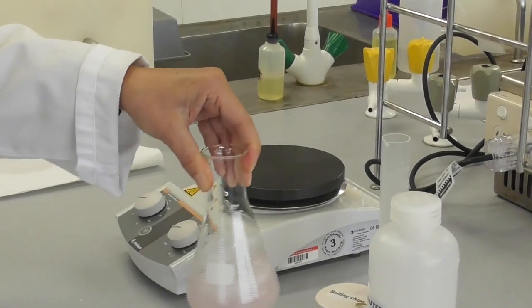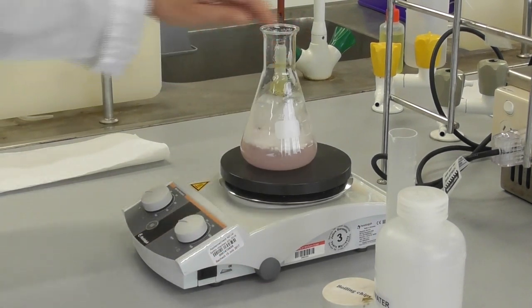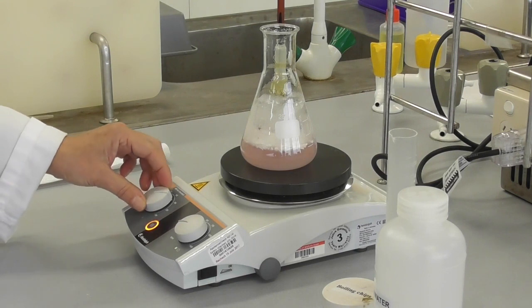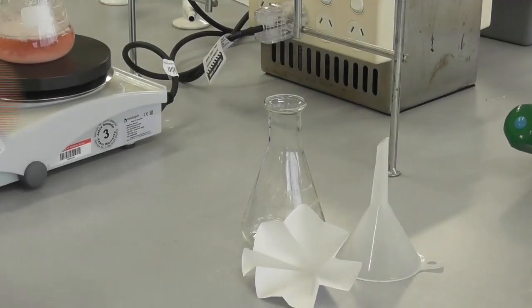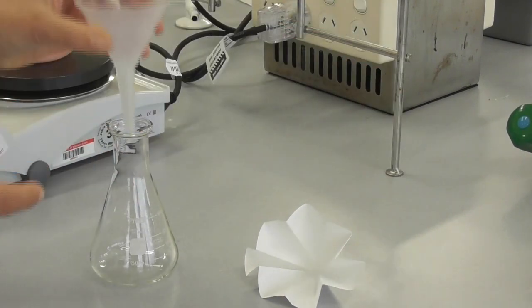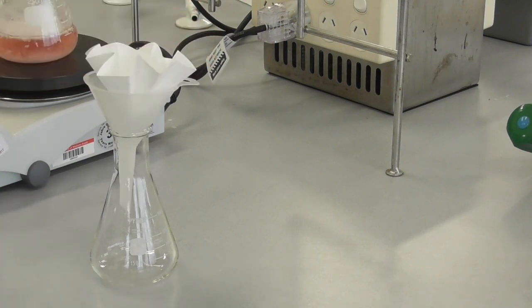We swirl the mixture and then put it on a hot plate to heat it up to near boiling. While the solution is heating up we can set up the gravity filtration with another conical flask, a funnel and a fluted filter paper.